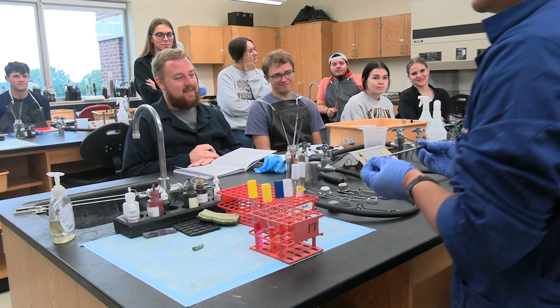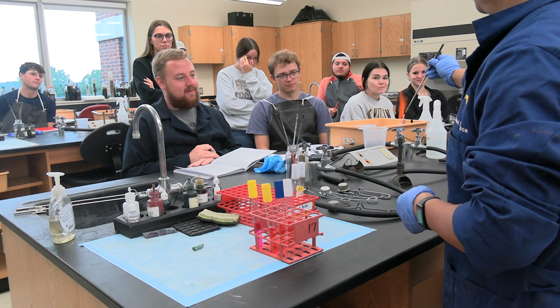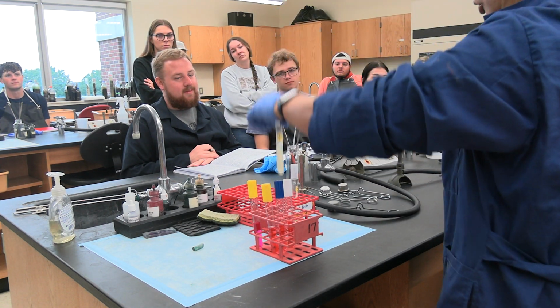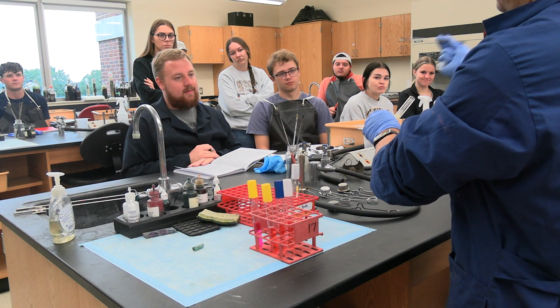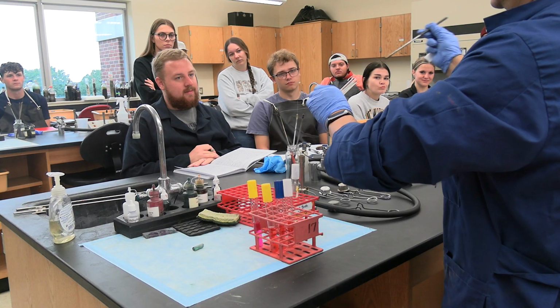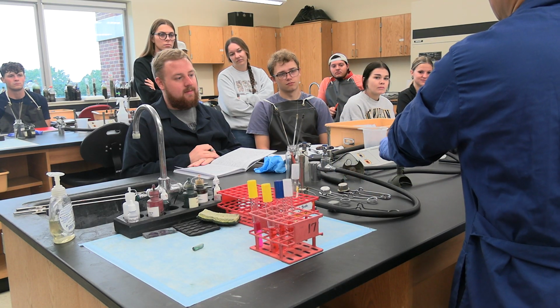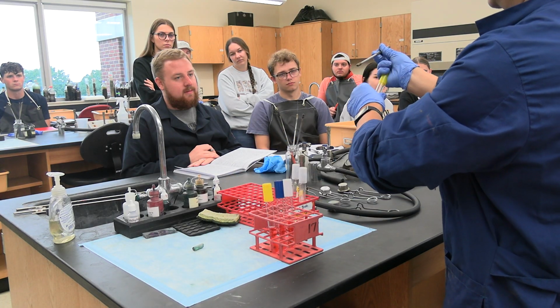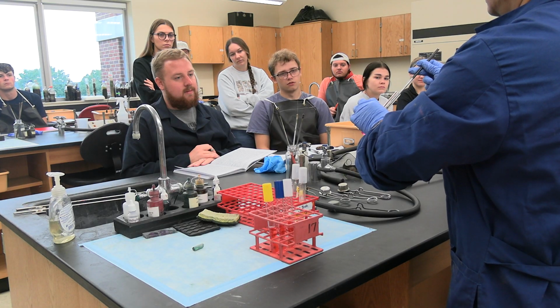Occasionally is fine. Flame the loop. Okay, simple. Only one. If you do E. coli, your batch partner does Citrobacter, not the double. Same thing. Little finger, flame, touch the bacteria, flame. Assuming you labeled, flame. That's all.